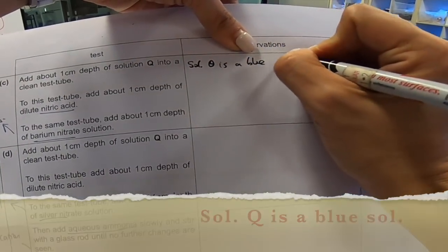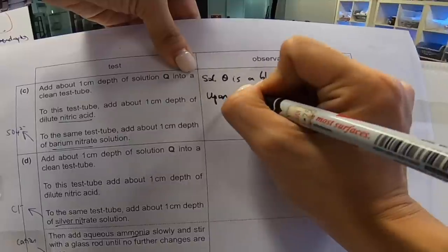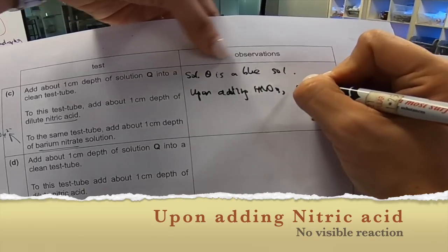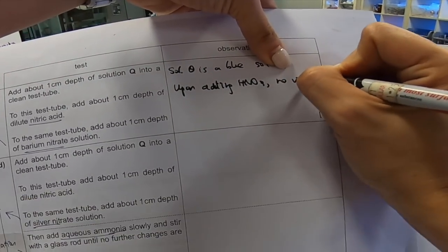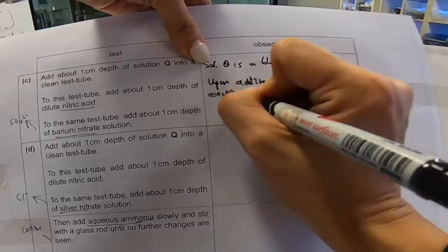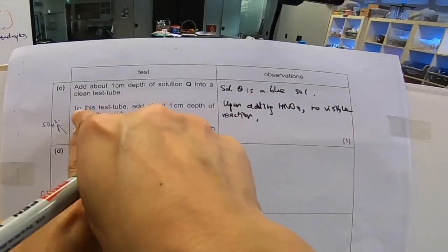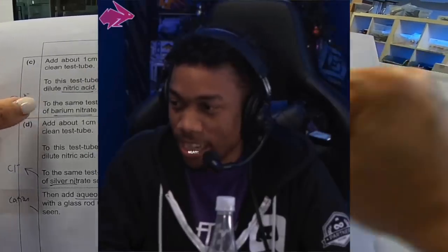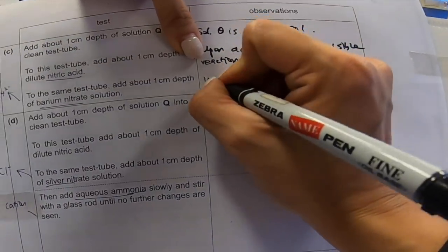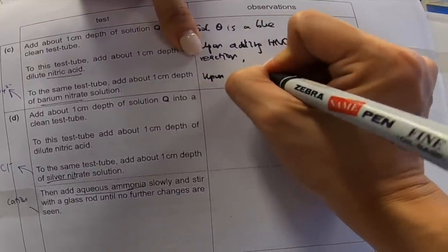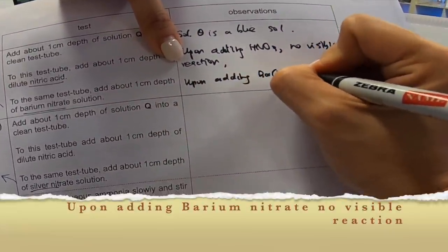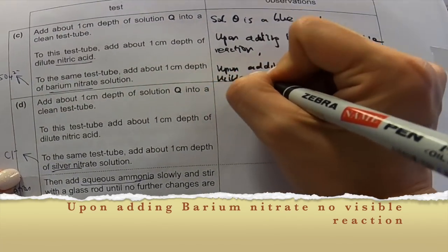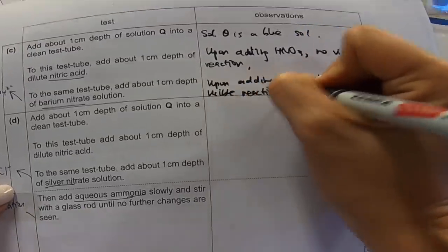Then, we're going to add barium nitrate according to the marking. No visible reaction. Let me quickly put this aside. And then, write down my observation. Solution Q. It's a blue solution. Upon adding HNO3. No visible reaction. Upon adding BANNO3. Also, no visible reaction. Let's move on. Part D now.